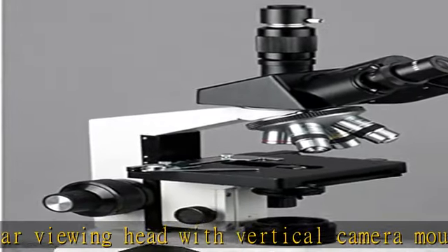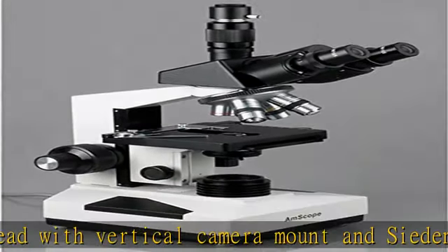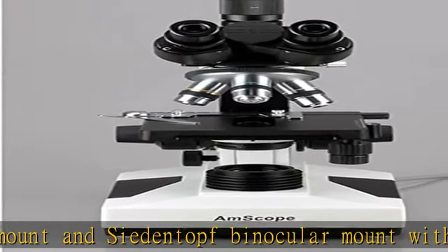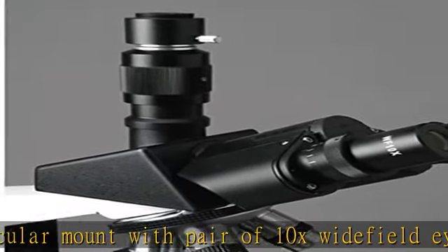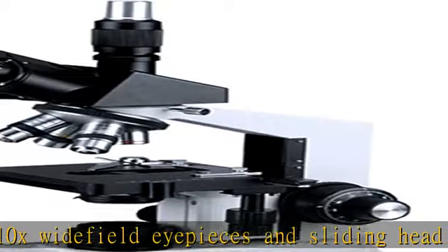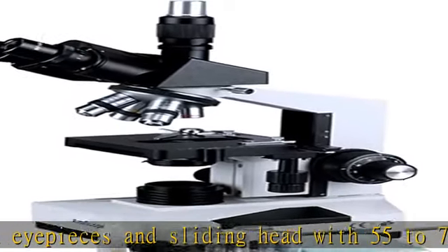360 degree rotation capability to provide a more comprehensive view and enable sharing. Forward-facing nose piece with 4x, 10x, 40xs spring, and 100xs spring oil DIN achromatic precision ground optical glass objectives that provide color correction of magnified images, bright field.